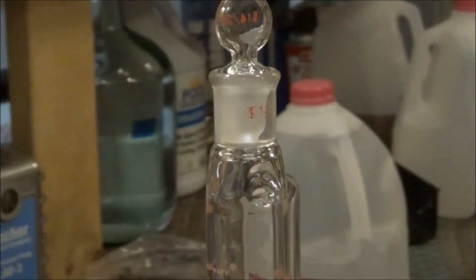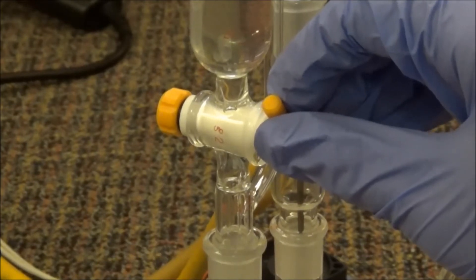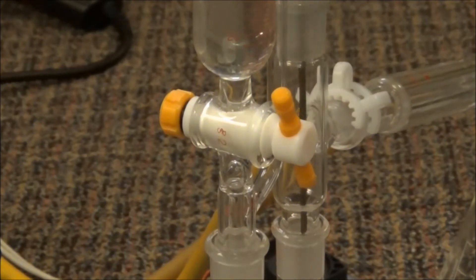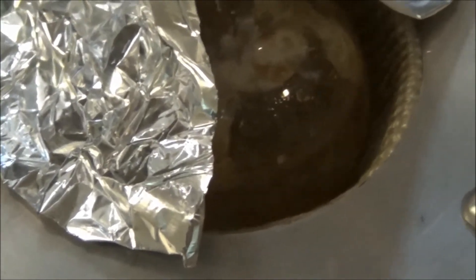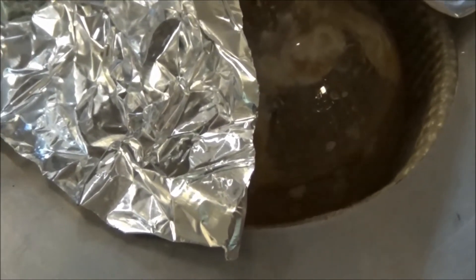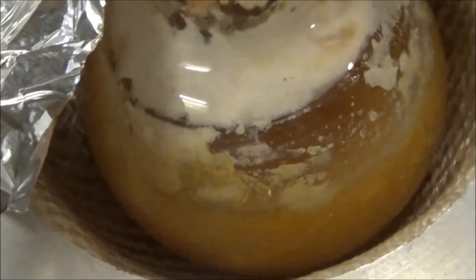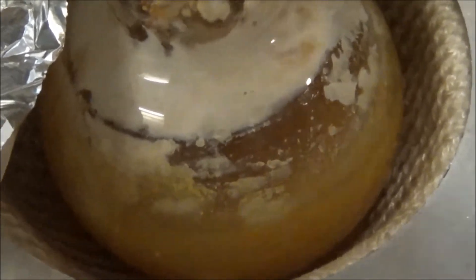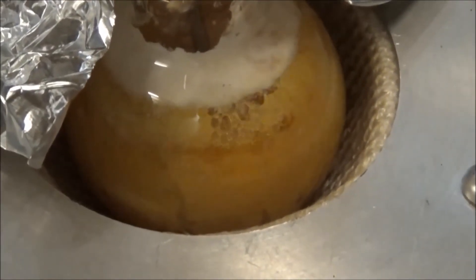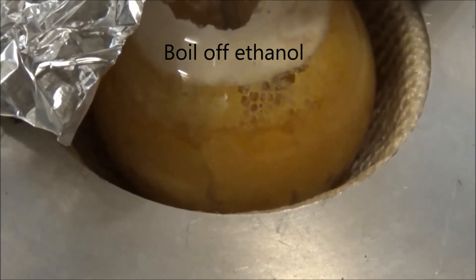When the flask had reached about 125 Celsius, I started slow and careful addition of sodium ethoxide. Because the mixture was hotter than the boiling point of ethanol, it started sputtering. As soon as you add the ethoxide, it begins to get very, very thick. This is why I had to use a metal wire, because I did not have a mechanical stirrer, and magnetic stirring will not work for something this thick. Eventually, I had added all of the ethoxide solution, and ethanol was boiled off with stirring.